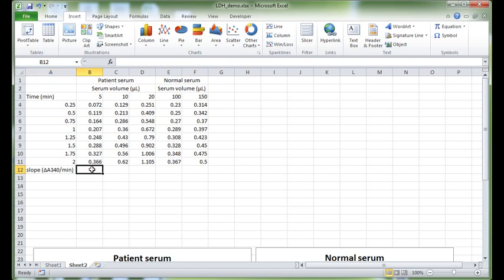Now, whenever you get Excel to do a mathematical calculation for you, you need to start with the character equals. For example, if we want Excel to work out the sum of 2 plus 1, we can do equals, select the 2 using our mouse, press plus on our keyboard, and select 1 using our mouse again. Then we press enter, and the result is shown there as 3.